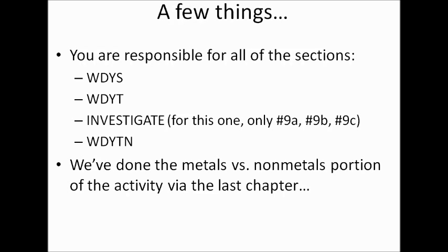First off, we've done the first part of this, which is comparing metals versus nonmetals by doing the same tests that we did in the previous chapter when we did our movie special effect. We focused on metals versus nonmetals. We did things like conductivity, malleability, luster, etc. That's the same exact thing for this chapter. So rather than repeating ourselves, we are going to be driving on and just focusing on oxides and elements. That's 9A, 9B, and 9C.